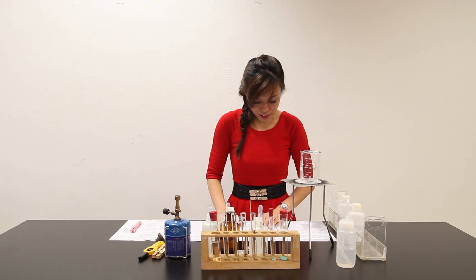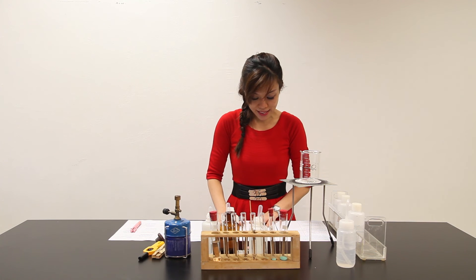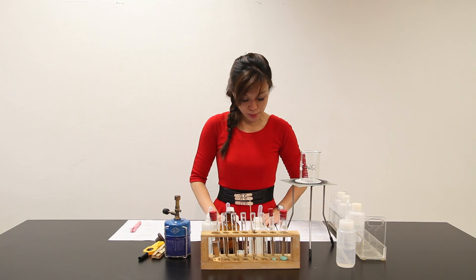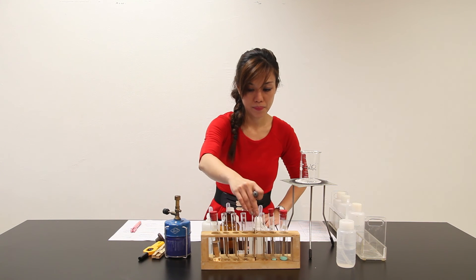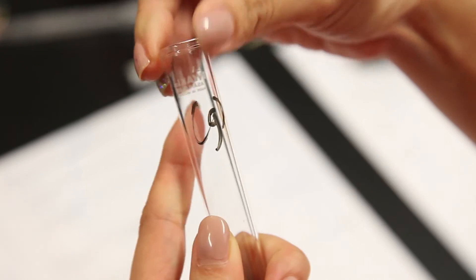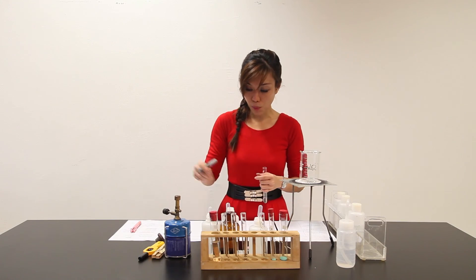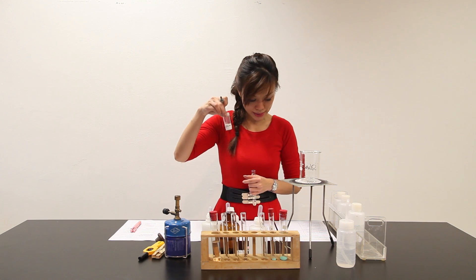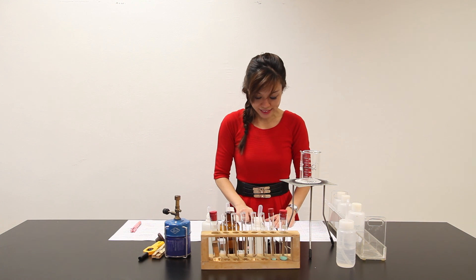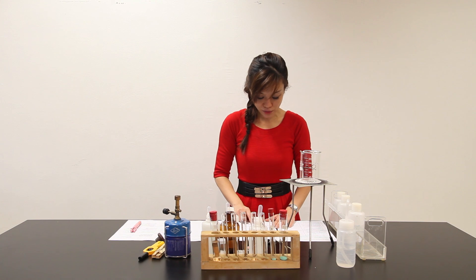Part G: place about 1 cm³ of Solution Z in a clean test tube. Add one spatula load of solid sodium chloride, insert a rubber bung, and shake the test tube thoroughly to dissolve the solid. For another test tube, add another 1 cm³ of Solution Z. Add one spatula full of sodium chloride. Add water until the test tube is over half full, then mix the contents thoroughly.